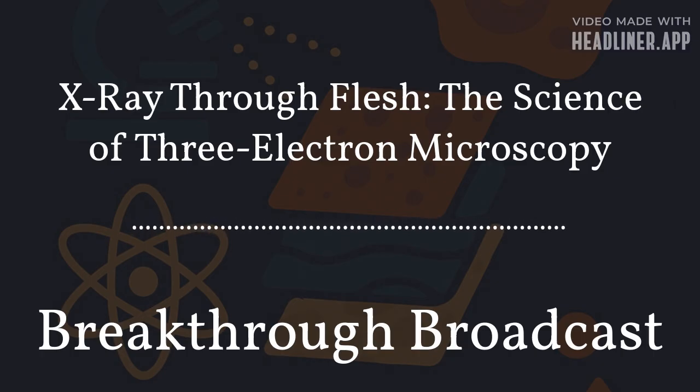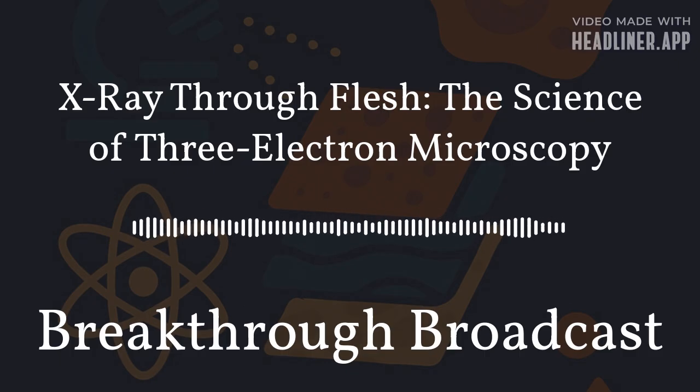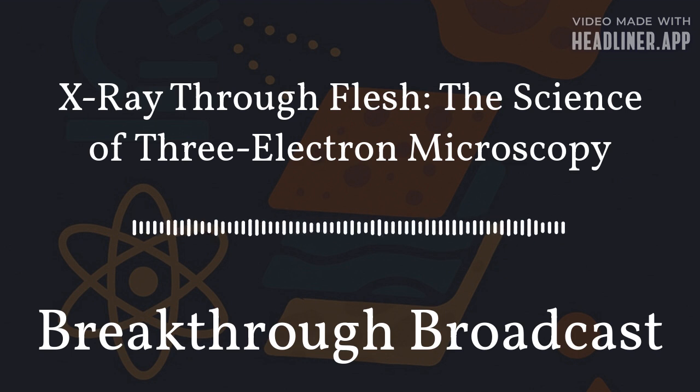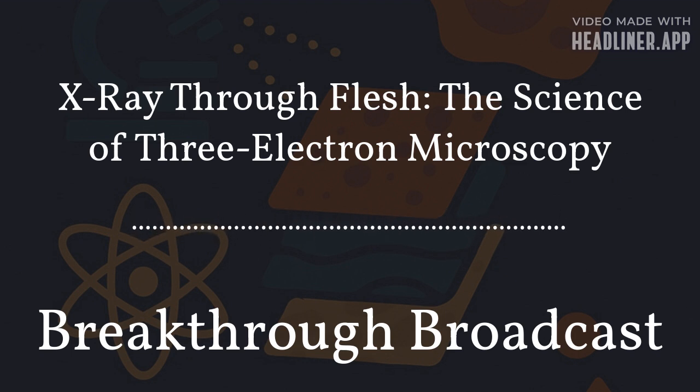approach discovery itself. In conclusion, three-electron microscopy represents a significant leap forward in visualizing the microscopic world. By merging secondary, backscattered, and transmitted electron signals, it produces images that are comprehensive, contextual, and scientifically meaningful.